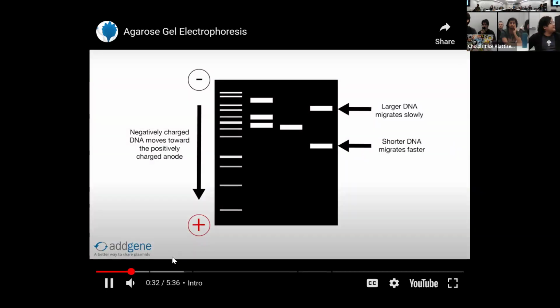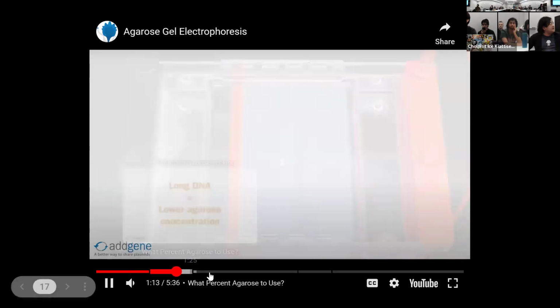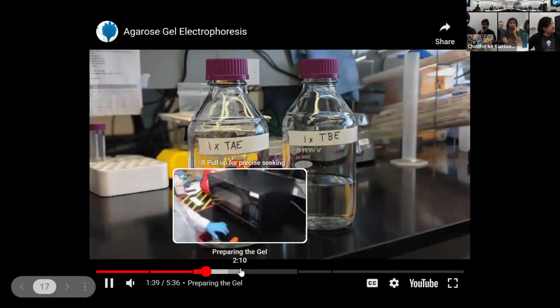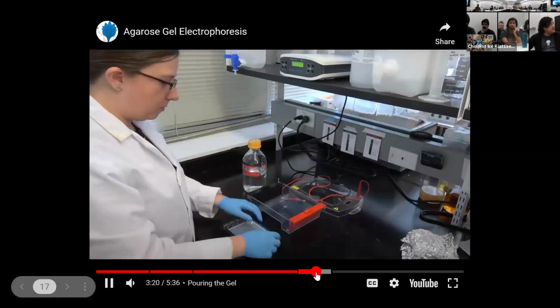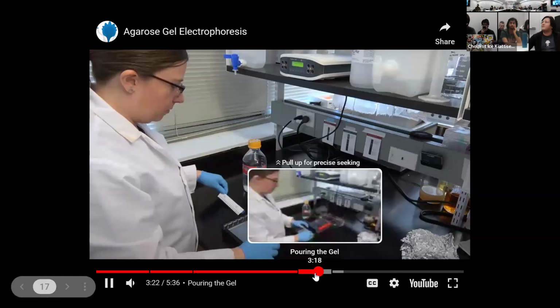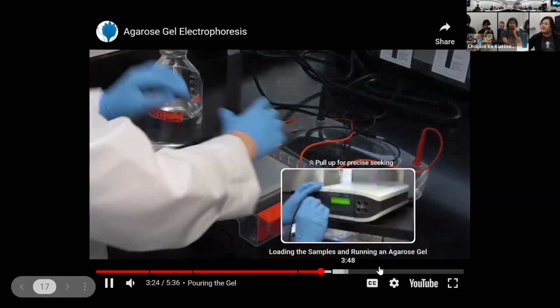Which is a collection of DNA fragments. So you just go pretty quick on here, and you can take a look at this further. There is some buffer or some system that you can work through. If you use a different buffer, a different system, they can move differently.